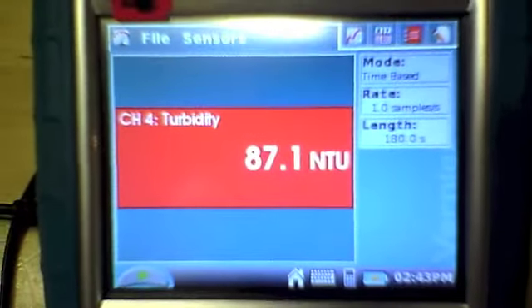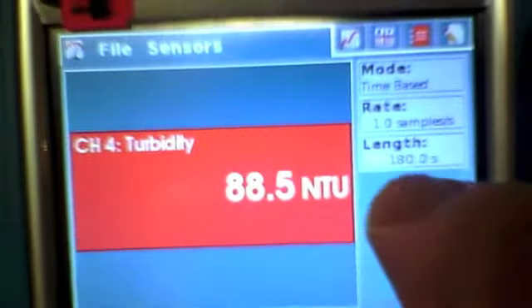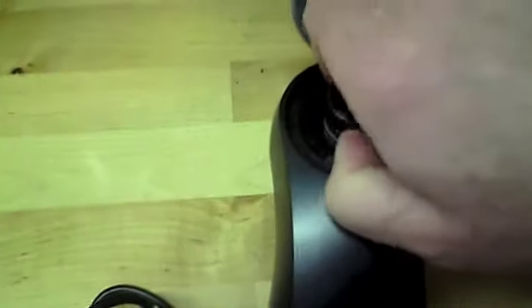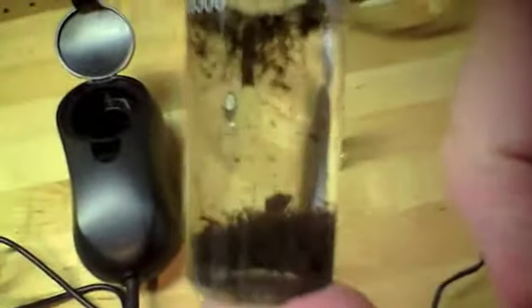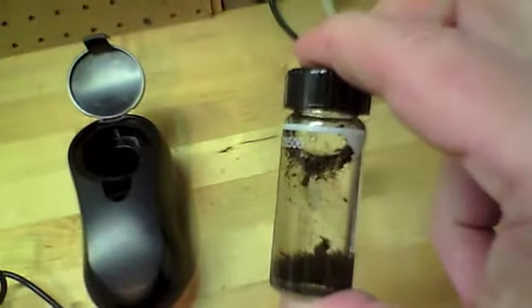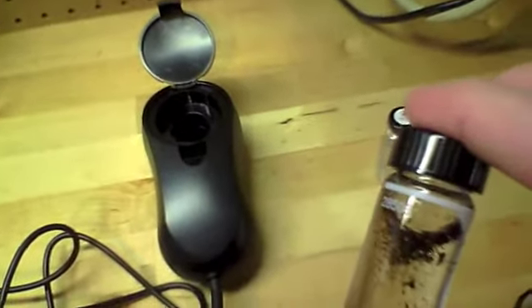After you've waited your 3 minutes, you're going to record this number, and then you're going to remove your sample. Remove your sample, and you'll take this container. You can see that that's settled down pretty much. You're going to take this sample, rinse it out, dry it out, and put everything back on the table the way you found it for the next group to use.